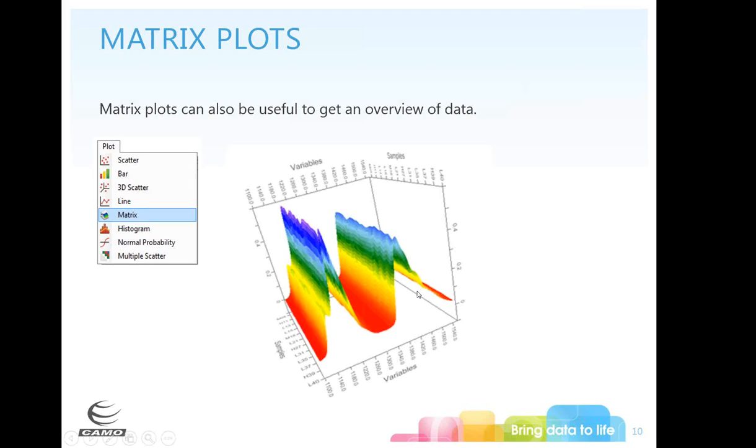But if you perhaps had a reaction going on, you might see this region increasing, or the region on the right increasing as you're going through the samples, while you're seeing the region on the left decreasing as you go through the samples. So you can see how there's some interaction between variables, and this is just by general plotting.